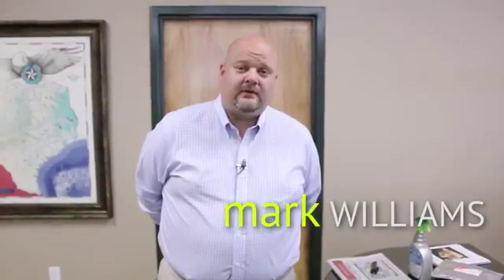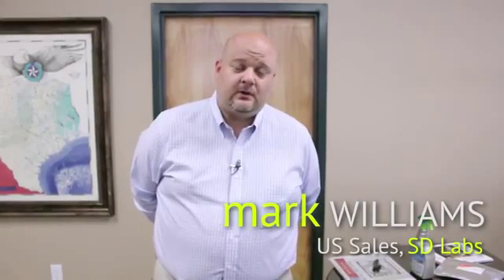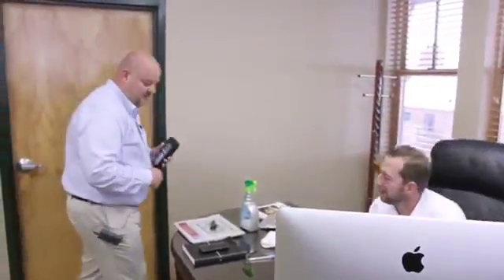We're down at the corporate office of HHS in Austin, Texas, and we've just walked into Joe Terry's office. We're going to do a live demonstration on how you use the ATP test monitor. Joe, hello. Thank you for allowing us in.